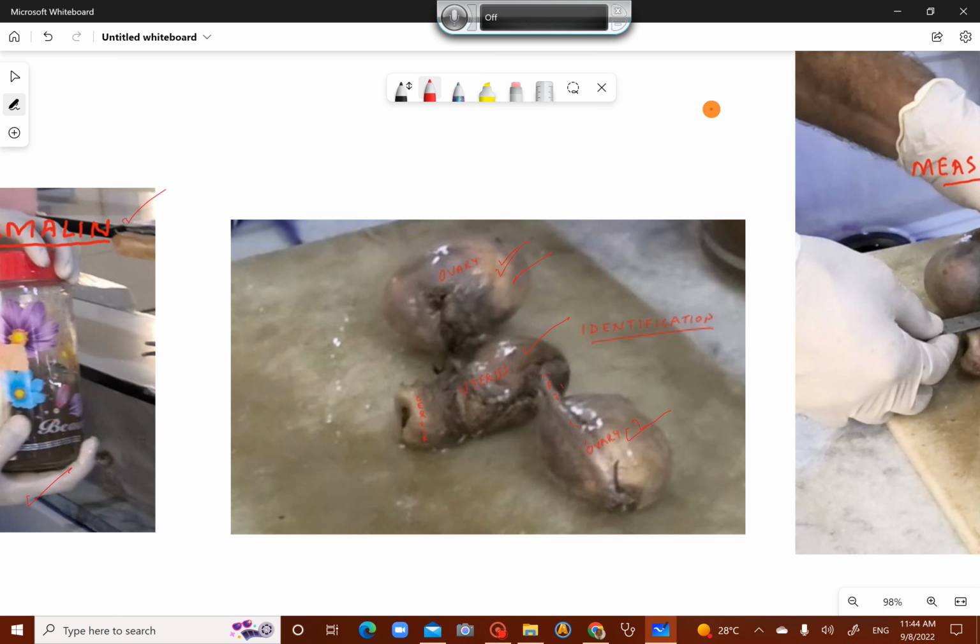Now this is a specimen removed at surgery during removal of the uterus, fallopian tube. So it's a bilateral salpingo-oophorectomy with hysterectomy. Easily identifiable. Sometimes it can be difficult to identify. So what is important is having clinical information.